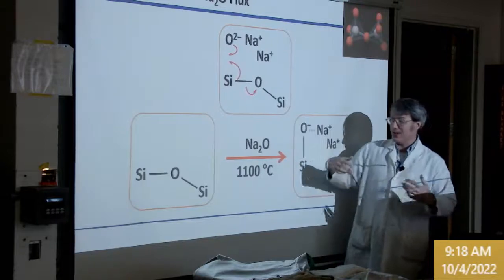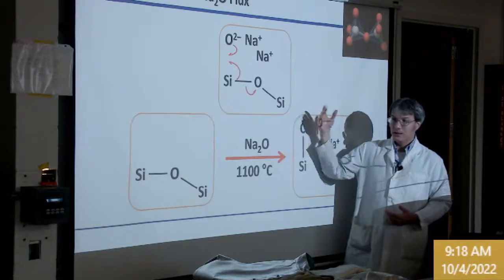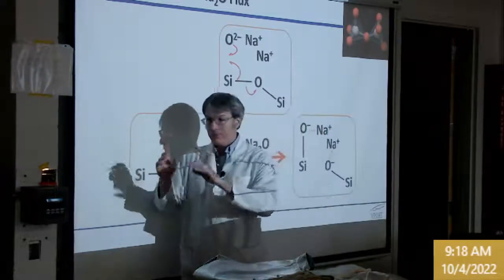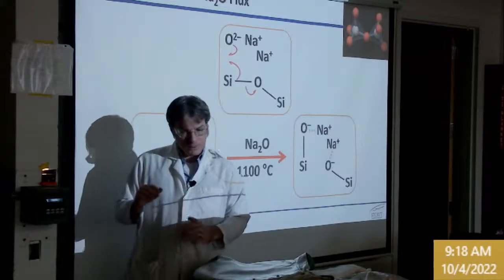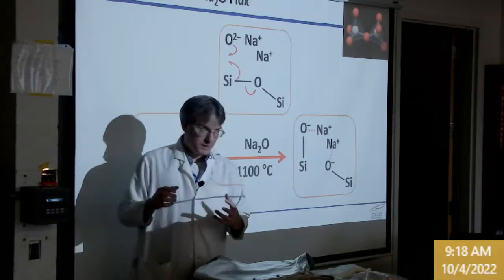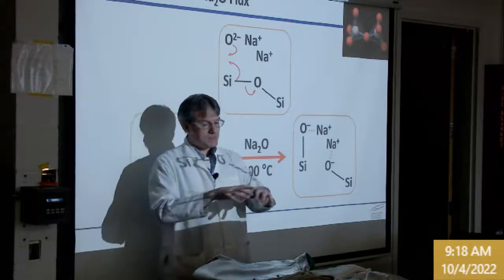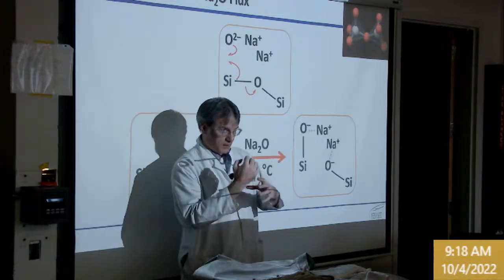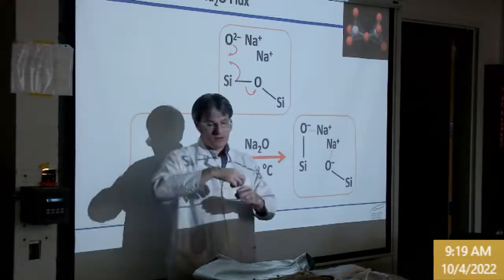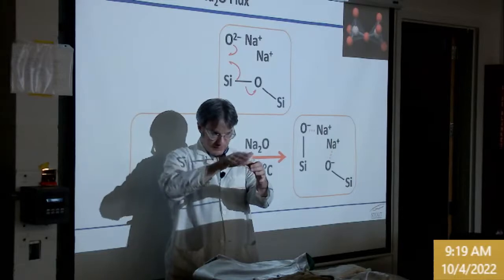That's a process called calcining. We calcined that and we removed the carbonate. So last night, I was doing the thermal ramp for the furnace. Once you get up around 1,000 degrees, you can actually hear bubbles popping in that furnace because the surface skins over with glass and it's still blowing carbon dioxide bubbles from the reaction that leads to sodium oxide.